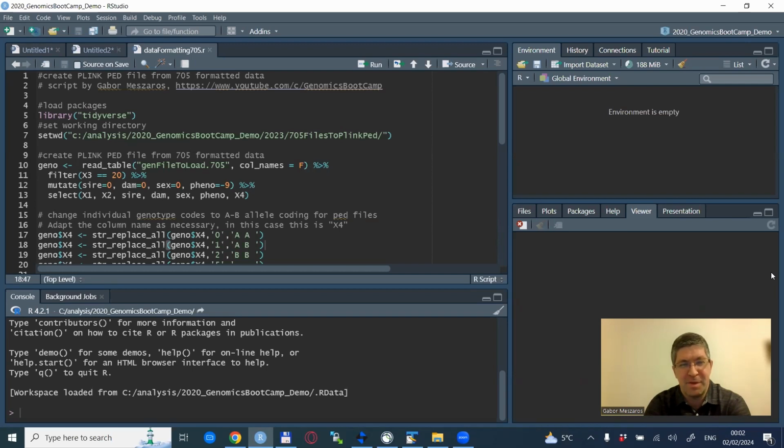This time we will be speaking about changing the so-called 705 file format to PLINK. Well, this is a very specific file format, so maybe this video will be useful for three and a half people, but still, I think it is useful to know.